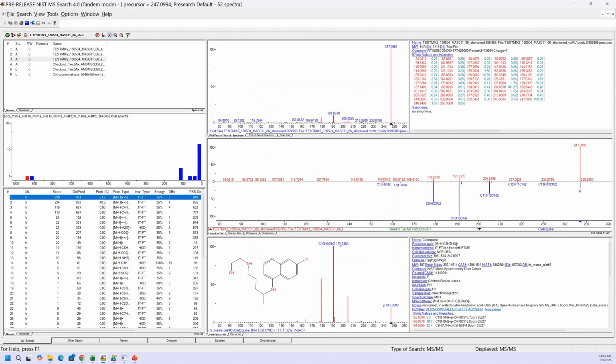So you can say okay, and you could save that as part of your configuration if you wanted to for your in-source ions. But what we have at the bottom now is the best hit for the in-source. And now you see it's 928 as we saw within the chromatogram window, but now the correct structure, or a correct structure that's a possibility, is shown at the bottom. So at the top is our unknown in-source ion at 247. At the bottom, you can see the MS2 best hit.